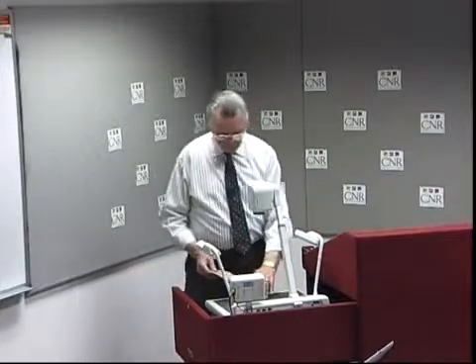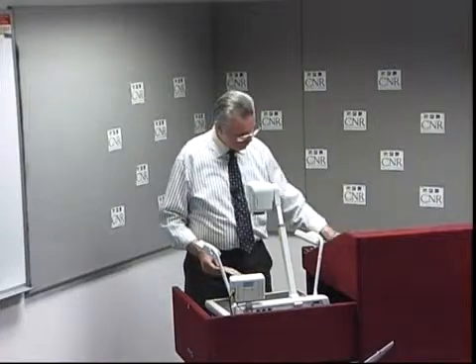I will show you now another technique. This is a hand sheet of OCC. It looks brown, as it should. It's linerboard. It's old recovered cartons, old cartons. They come from grocery stores, from Best Buy, from the department stores.